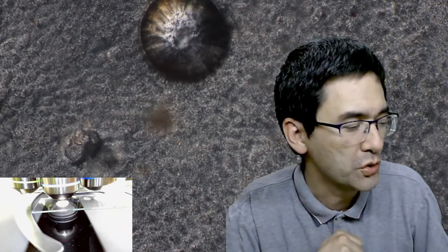Okay, again light adjustment - that's the 10 times, then 20 times, then 40 times objective. Again we see the cellular structure of the epidermis. Generally you don't find those openings on the top surface because you want to prevent the loss of water. Generally the top surface epidermis also contains sometimes a thick layer of wax called the cuticle, which allows water to be conserved better.